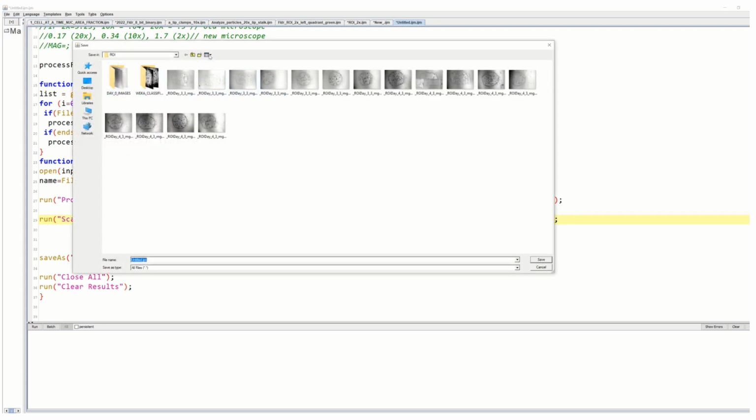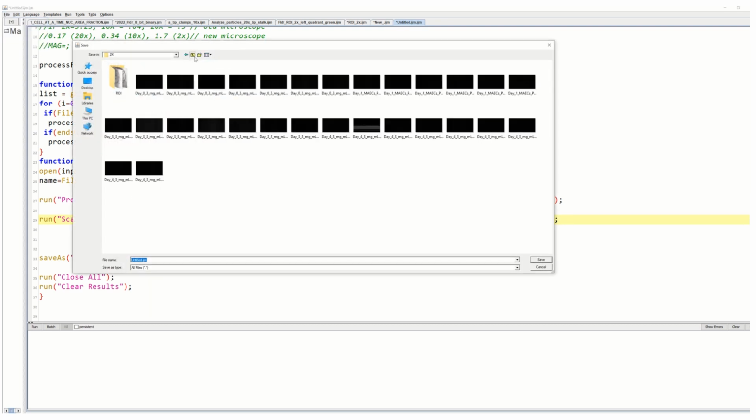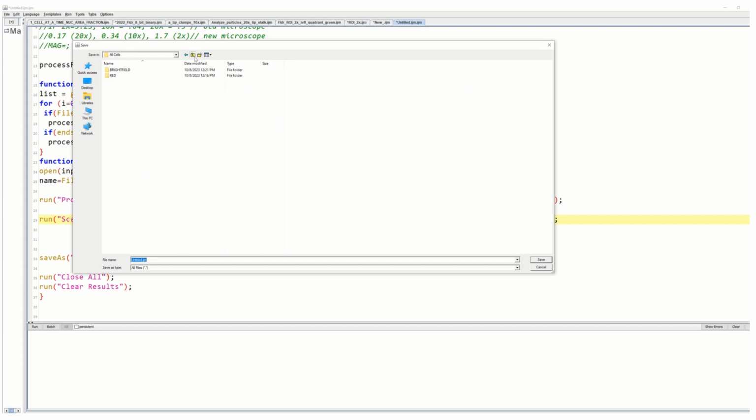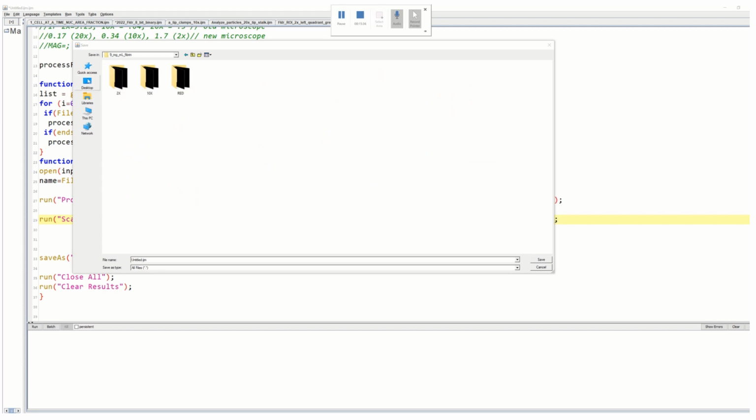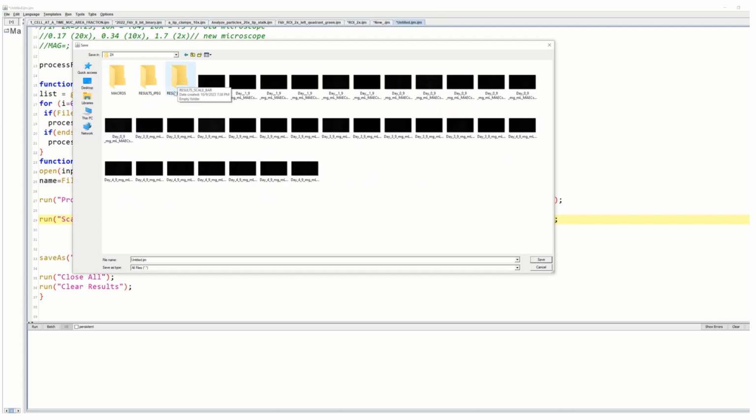and we're gonna go ahead and you go find your folder. So we go 3 megs per mil, all cells, bright field, 2x. I don't know if I'm in the, oh, I think I'm in a different folder. So we go to desktop. Let's go find our folder. Okay, I found my folder. So now 2x. So I'm saving my code.